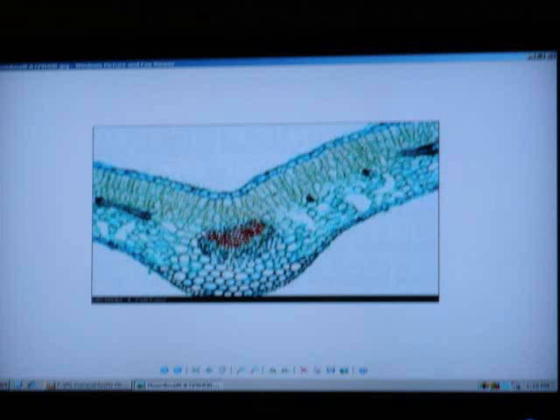Now when I'm done, I close it. I go to my computer. Now, I like to view thumbnails so I can see the pictures. There they are. And the one I just got a minute ago, there it is. And I'm just cutting and pasting. The new one I got was that one right there.